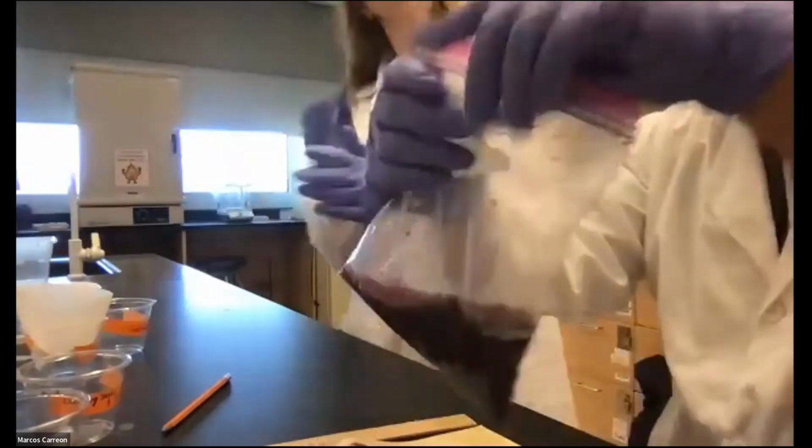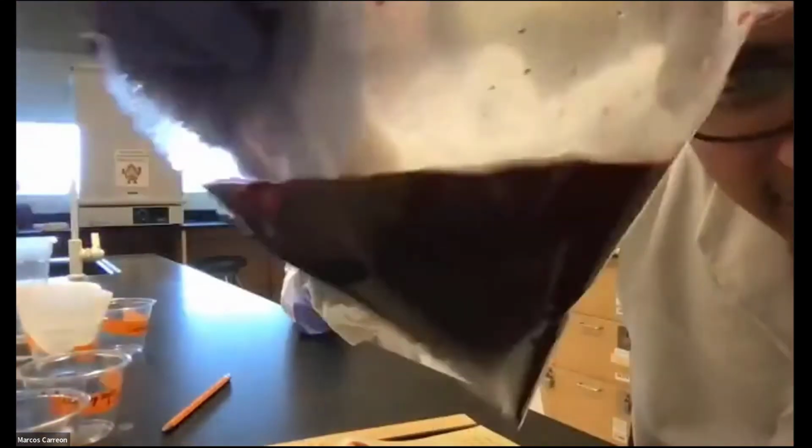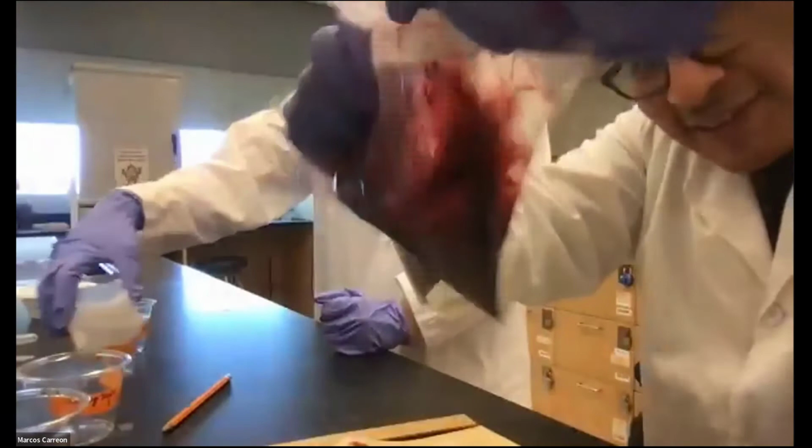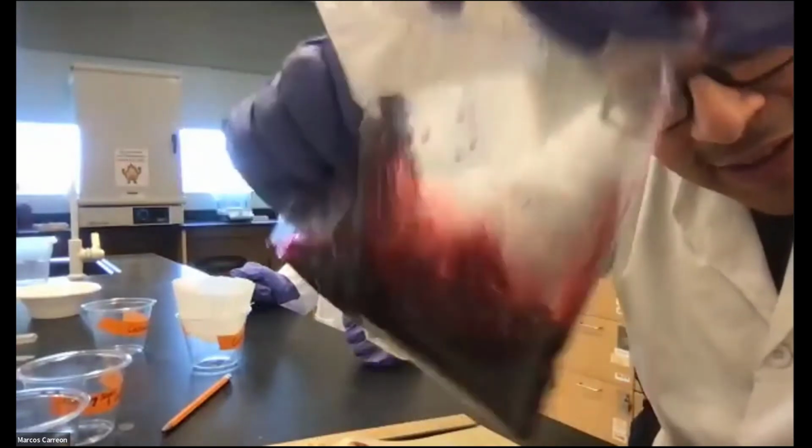So it kind of looks like, what kind of drink is that? Grape juice. Grape juice looking. So yeah. Hopefully you guys can see the color. It's kind of grape looking or cranberry.